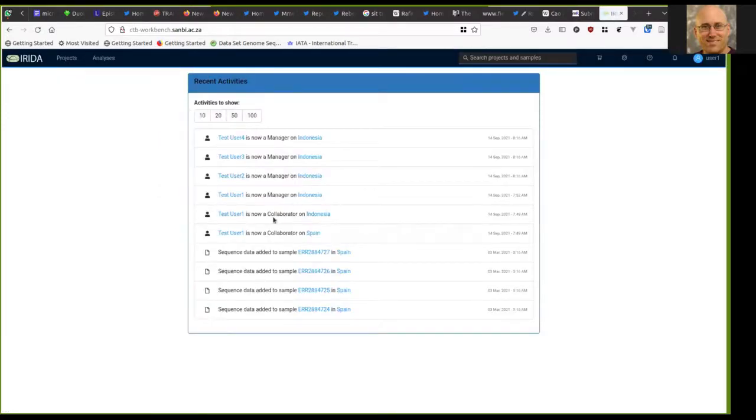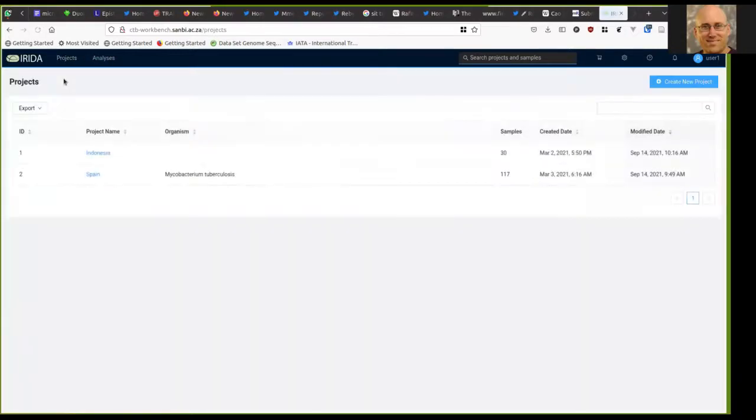Recent activity shows some analysis that has been happening. And you see over here, I can browse projects. So there's 2 projects with data already loaded. You can create new projects here in the corner, but I'm not going to use that right now. So let's have a look at this data.